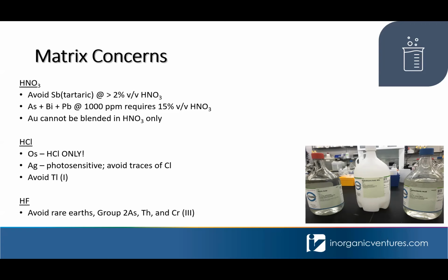So speaking of HCl, we do have issues with osmium, but not in the HCl matrix. So we recommend that you use an HCl matrix only when you're working with osmium, and that's to avoid the formation of the toxic and volatile tetroxide complex. So in order to avoid that, you want to stay in an HCl matrix.